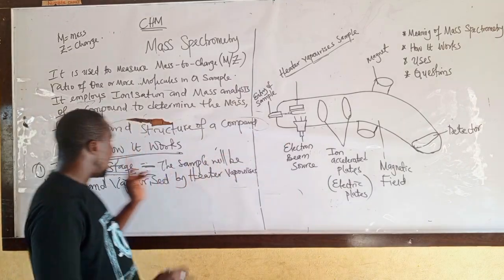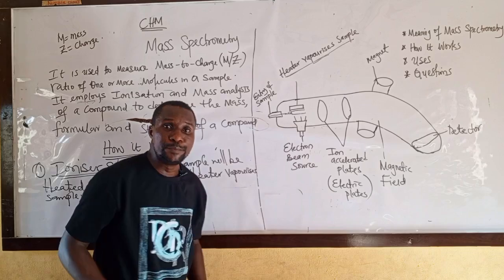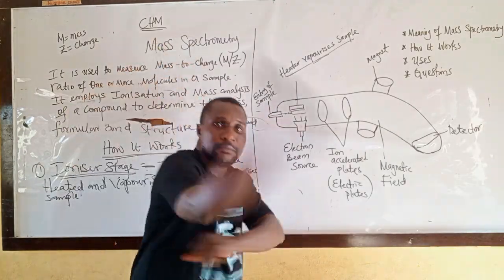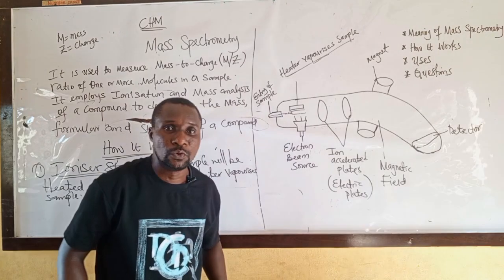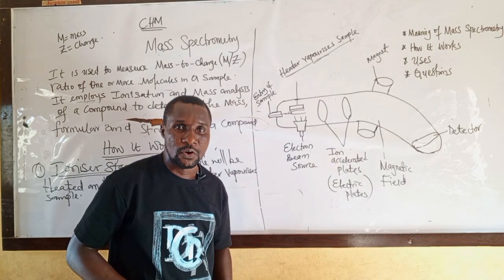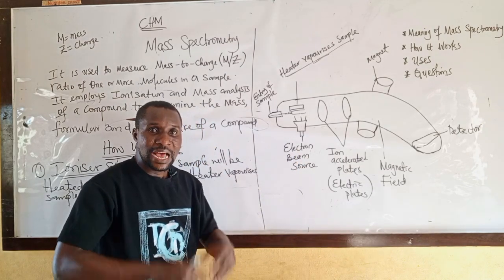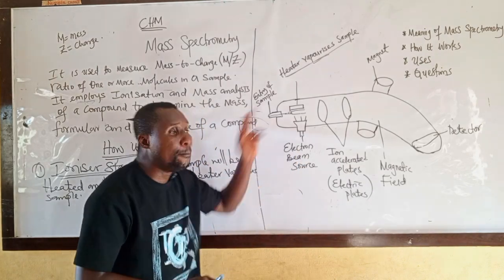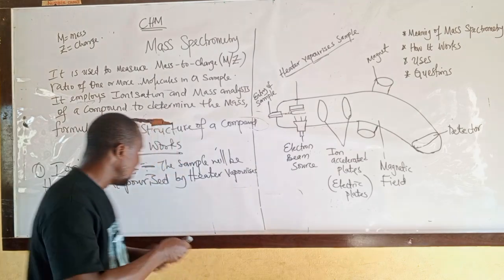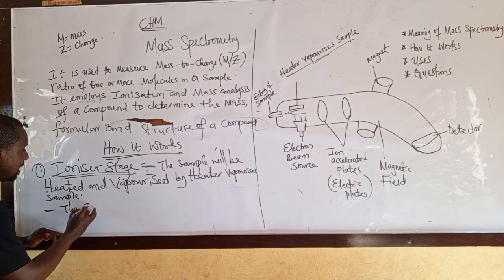Then, at the first stage again, what will happen? This electron beam will produce high energy electrons that will bombard the sample, the vaporized sample or the heated sample. The electron beam will provide high energy electrons that will bombard the heated sample.